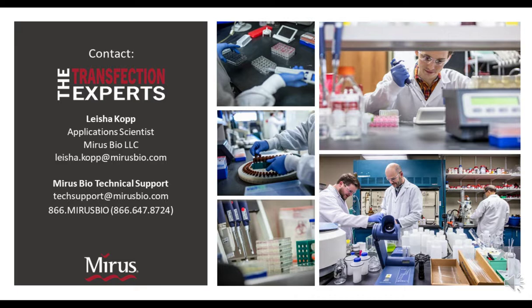And do transfection complexes have to be 10% of the culture volume, or is 5% volume also okay? Great question. So we see people, the most common range for complex formation volumes would be within that 5 to 10% of the total culture volume. Our protocol is written for 10% of the culture volume, but we've also done pretty extensive testing using 5%. We kind of refer to those as 2X complexes because the active ingredients, the DNA and the reagents, are twice as concentrated within that matrix. And we find that that also works well out to about that half-hour point.